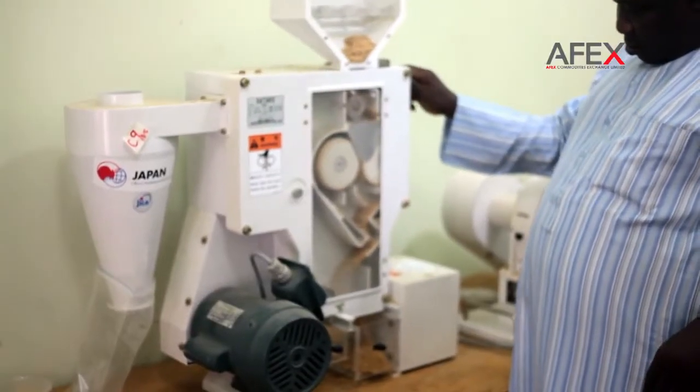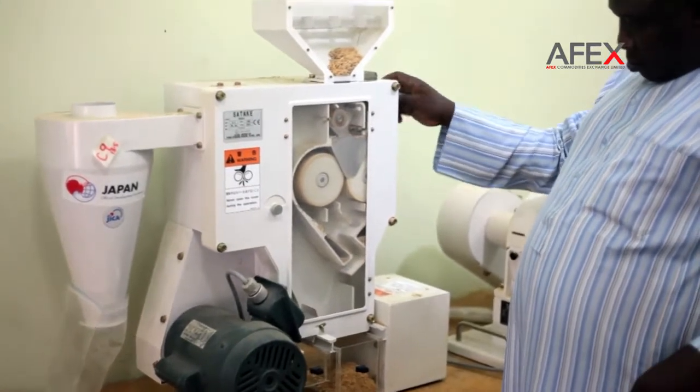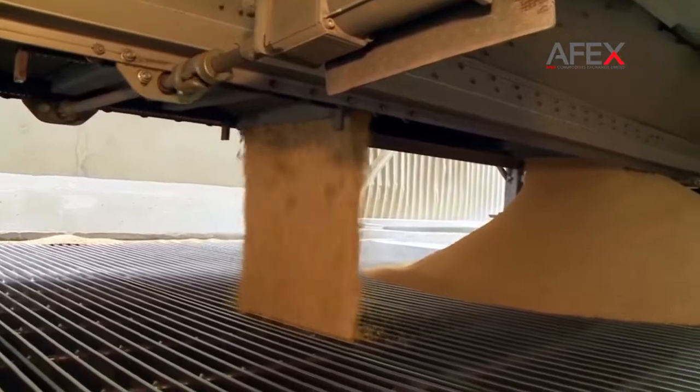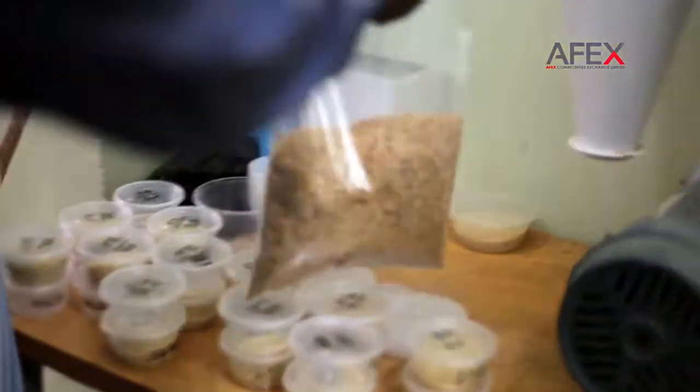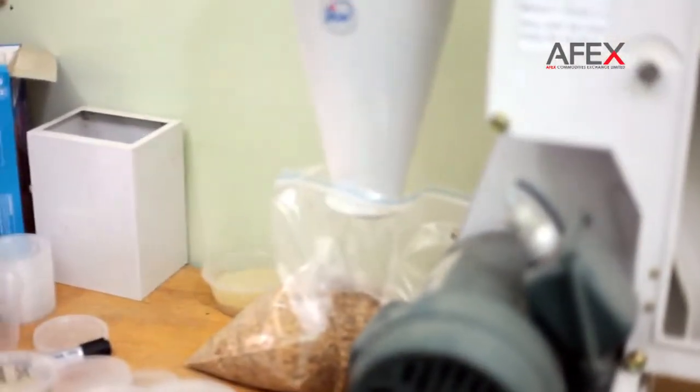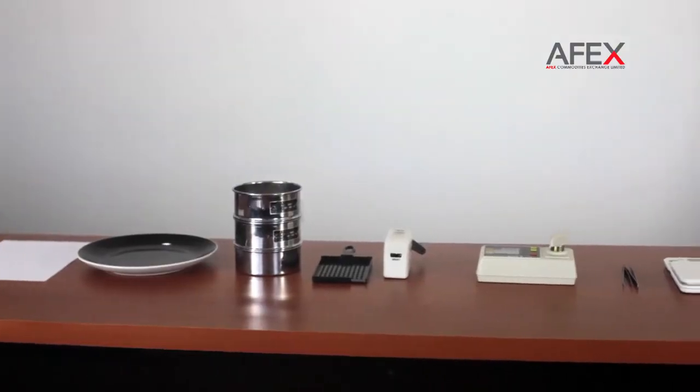Although there is a standard grading method in Nigeria that can be conducted only in well-equipped laboratories in big mills, we suggest that farmers, paddy dealers, and extension agents conduct paddy quality checking using hand tools.